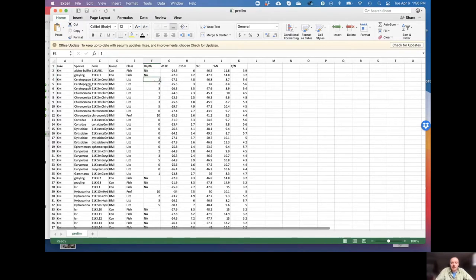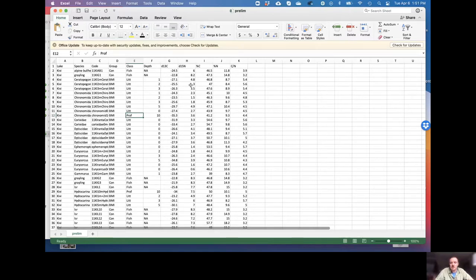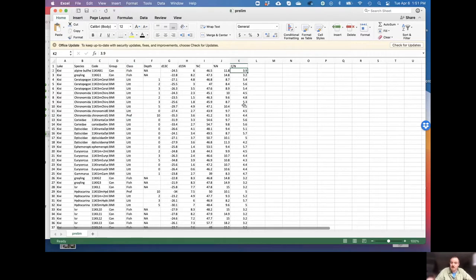We have grouping variables: consumer fish, piscivorous fish, BMI for benthic macroinvertebrate, and ZPL for zooplankton. We've also classed things as fish, littoral shallow-water invertebrates, or profundal invertebrates based on depth recorded. Sample depth is not available for fish, but for invertebrates we have samples at one, two, three, five, ten meters depth. All samples have a carbon isotope ratio, a nitrogen isotope ratio, percent C, percent N, and C:N elemental ratio.